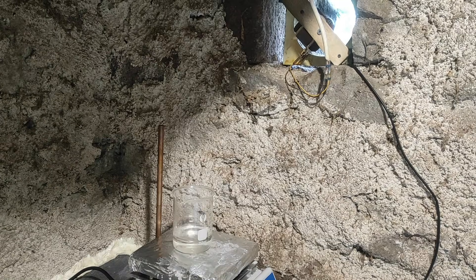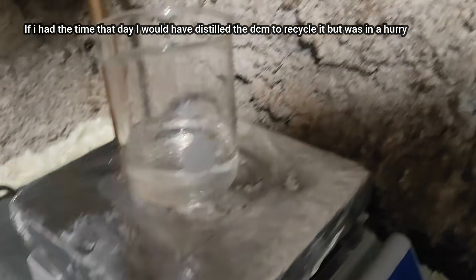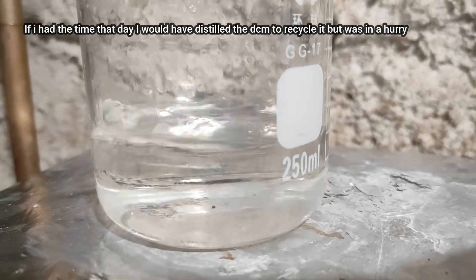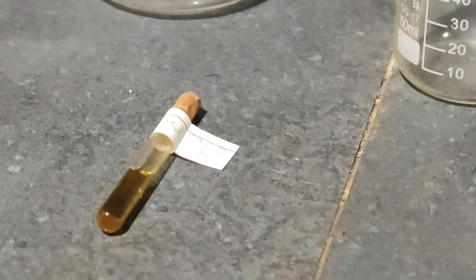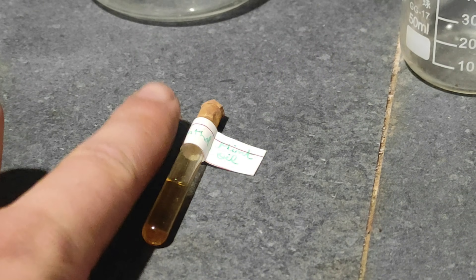Then I heated the DCM solution on the hot plate with the fan on to boil off the DCM and be left with only menthol. In the end, I put everything into this little test tube — very tiny, as you can see compared to my finger, but it's very cute.